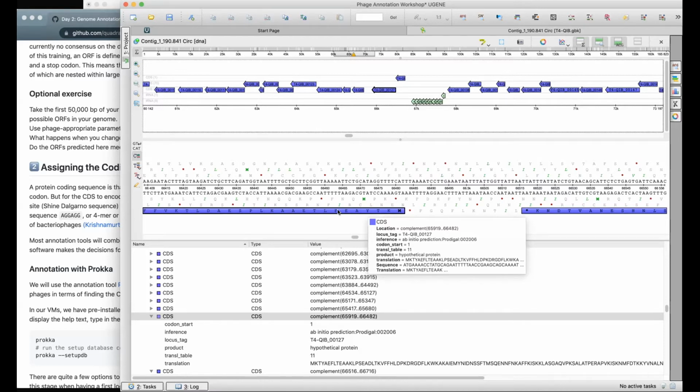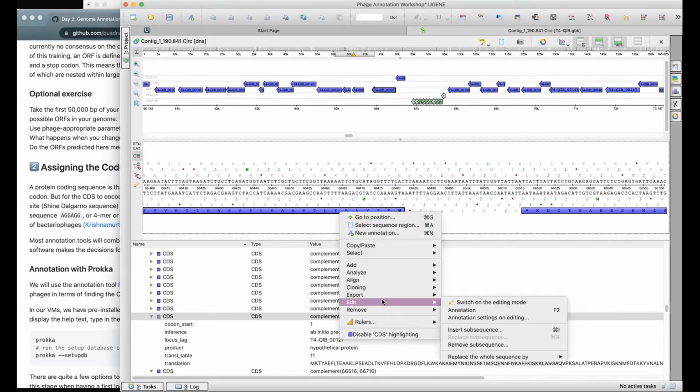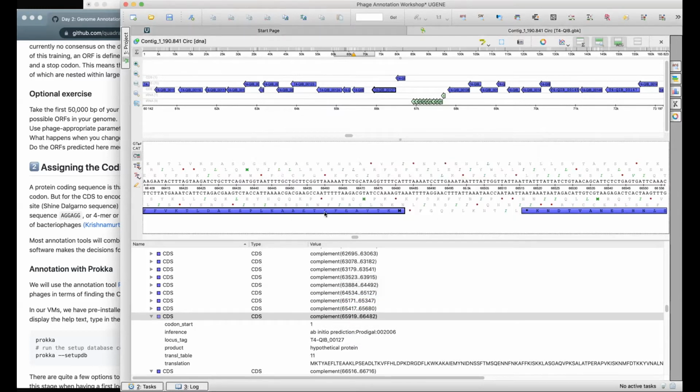It's just really quick. I think this has, because you can edit the annotation, but you need to know the coordinates that you want to edit it to, or you need to do that by dragging and selecting. Okay. It's just that if you have that, then you can very, very quickly check the ribosome binding sites of all of the start codons in the gene, up and downstream. Okay. In this case, use Artemis. Well, I've never actually used it because it was always throwing up errors on my Mac.